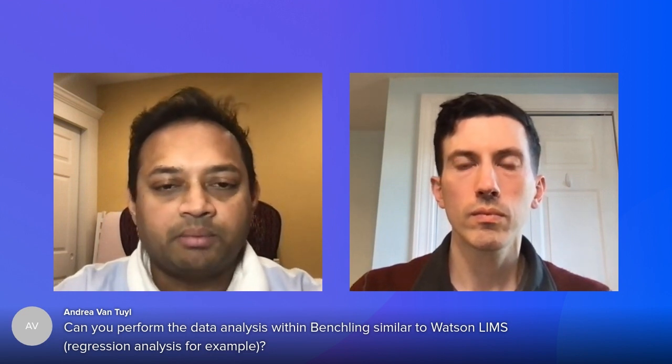Just a couple more questions here. Can you perform the data analysis within Benchling similar to Watson LIMS, regression analysis, for example? So I think now, with that Insights product, we do allow some of these analyses, like regression. Maybe Tom, you can comment on some of the specific types of curve fitting we can do now.